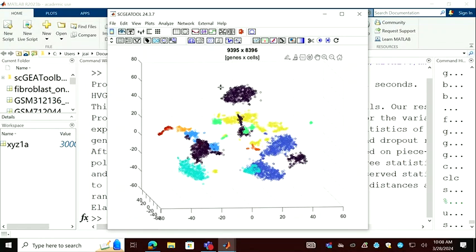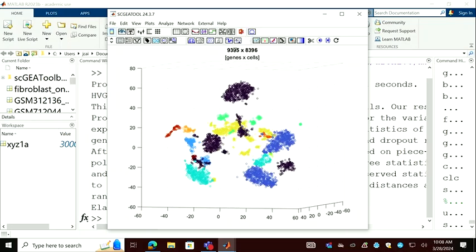Now the highly variable gene expression analysis requires a homogeneous population of cells. So I'm going to select one of the groups rather than apply highly variable gene analysis to all the cells. That doesn't make sense, because in that way we probably only get those marker genes expressed in one cell type but not another. That gives you the on-off variability among cell populations. But what we really want is to find, among a homogeneous population of cells, what the highly variable genes are in there.